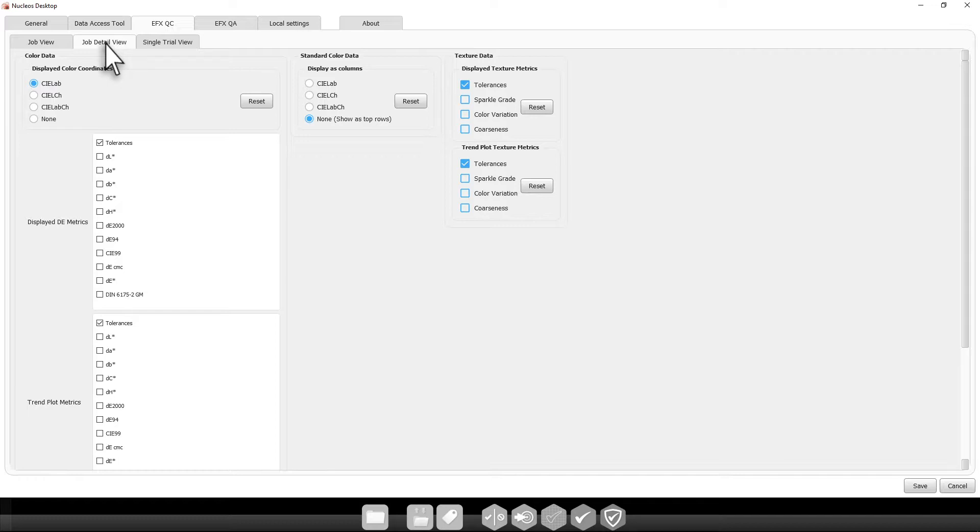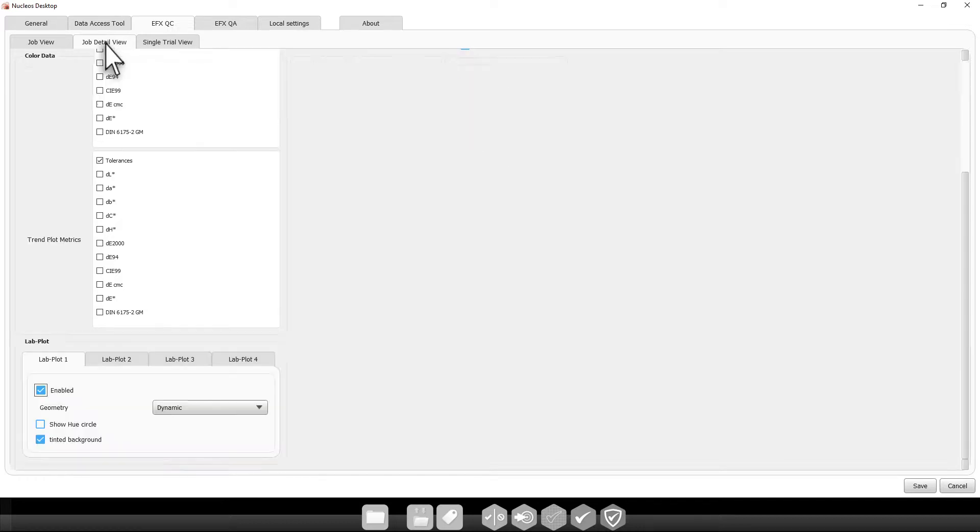This includes color data, Delta E metrics, texture data, and your LAB plots.